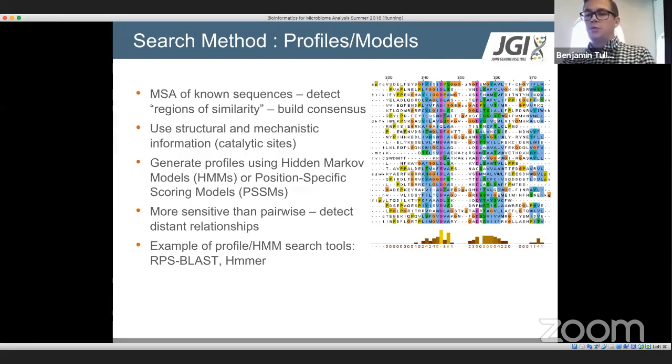So what we want to be doing in a lot of these situations is detecting areas of similarity. One way we can do this much more specifically, moving away from a general alignment using BLAST, and we'll get into a little more detail on this, is using something like a hidden Markov model, or an HMM. It requires some information before we get started. But instead of doing this very large similarity search, can we find a sequence that looks exactly like the element that we're looking at?